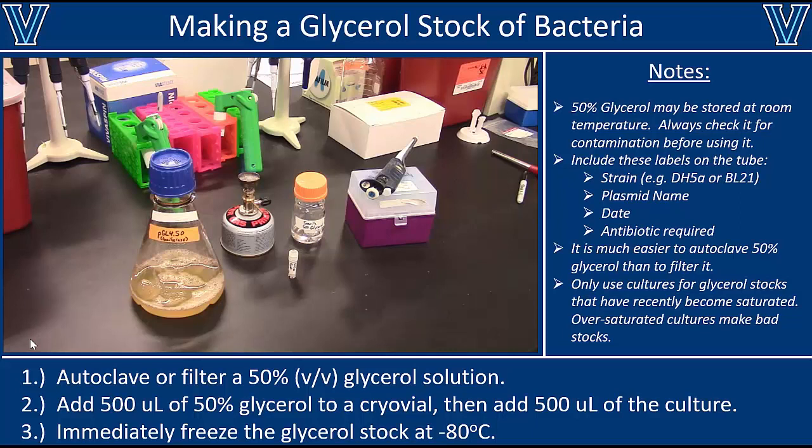One word of caution for future use of these glycerol stocks: whenever you take one out of the freezer, make sure you don't let it thaw. Every time a glycerol stock freezes and thaws, some of the cells die. Work as quickly as possible — take it out of the freezer, scrape the tip to get what you need, and put it right back into the freezer immediately before it thaws. That glycerol stock will last a lot longer if you avoid repeated freeze-thaw cycles.